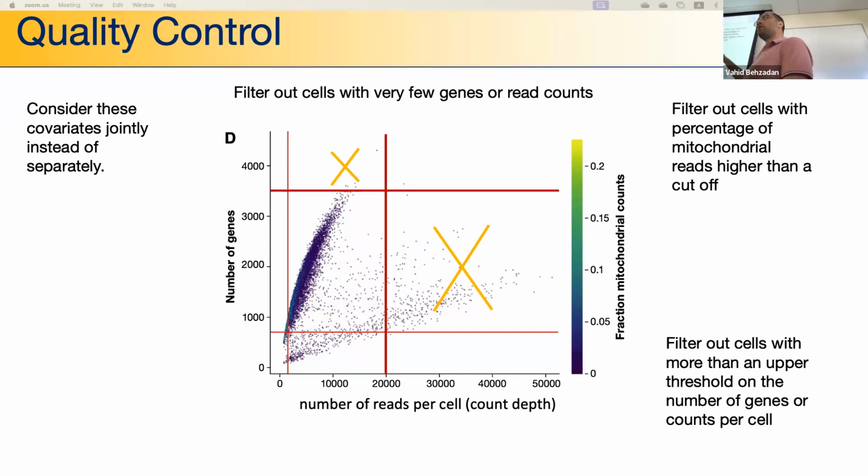So at this point, we are still at the quality control. We do it agnostically. We don't know what cells we have, and we don't know anything else. Just based on the number of genes and the nature of the low quality cells and dying cells, we filter out the ones that we don't need.